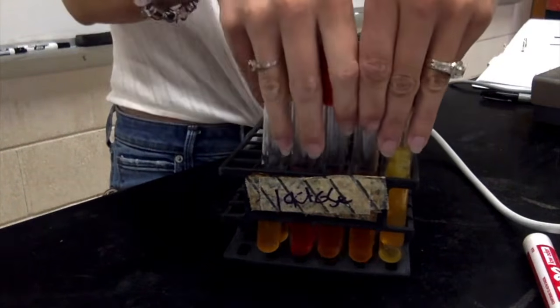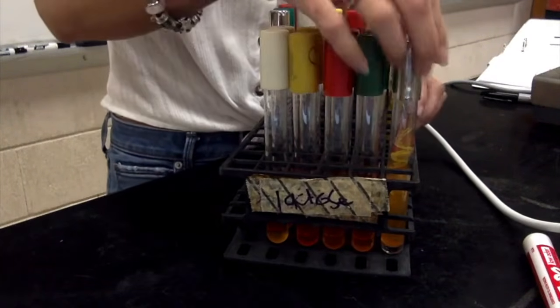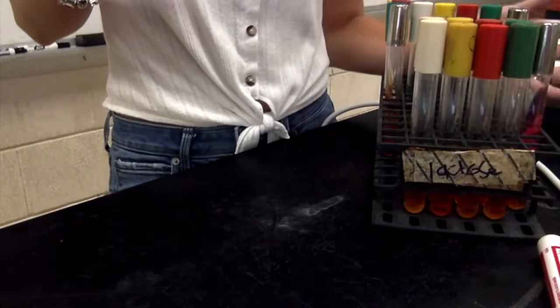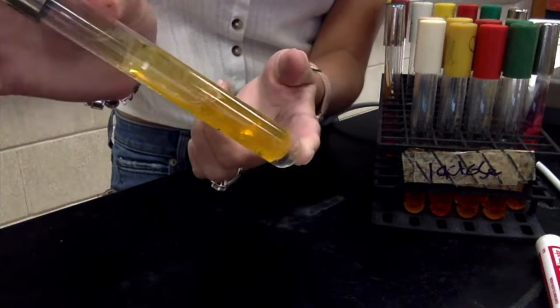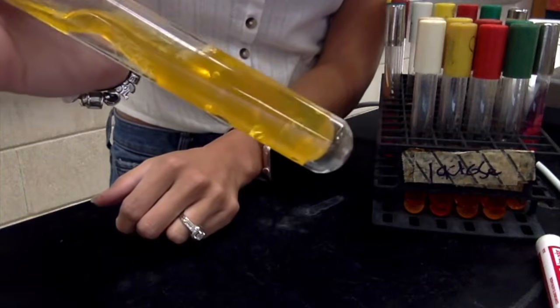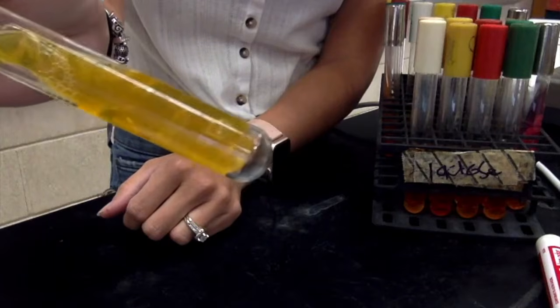Now let's move on to Citrobacter freundii. The first one we're going to read is our TSI tube. It looks very, very similar to our E. coli. A over A, lots of gas being produced, and it's negative for H2S.